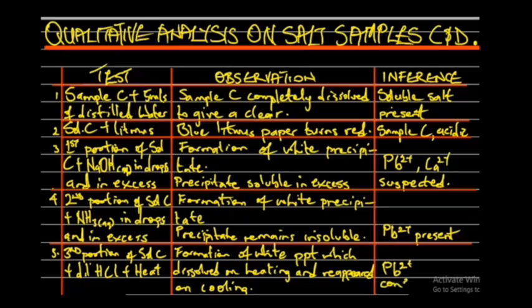Lead 2+ confirmed. We still have another test that can be carried out to confirm what we're actually talking about.